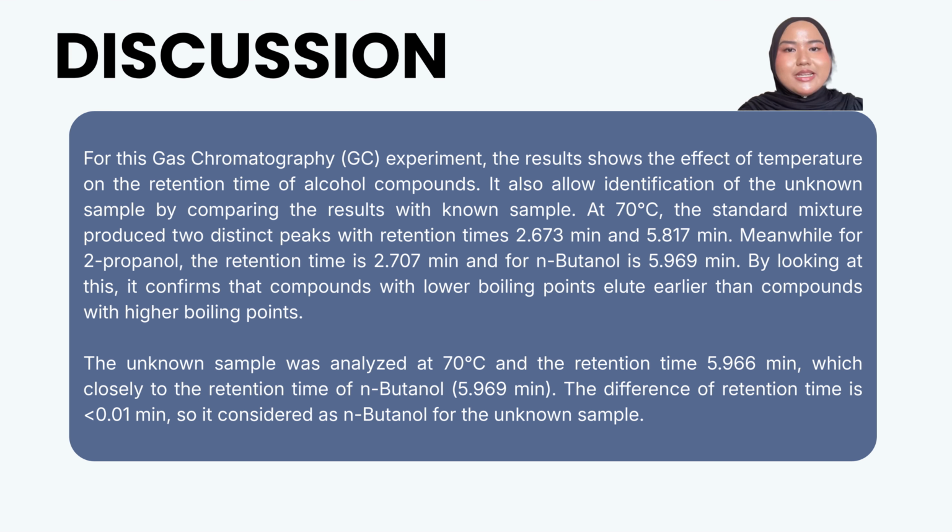The unknown sample was analyzed at 70 degrees and the retention time is 5.966 minutes, which is close to the retention time of N-butanol, which is 5.969 minutes. The difference in retention time is less than 0.01 minute, so it is considered to be N-butanol for the unknown sample.